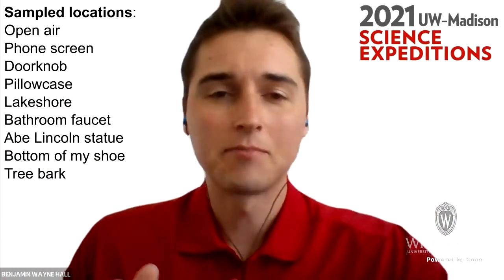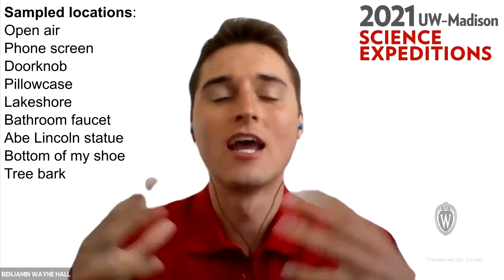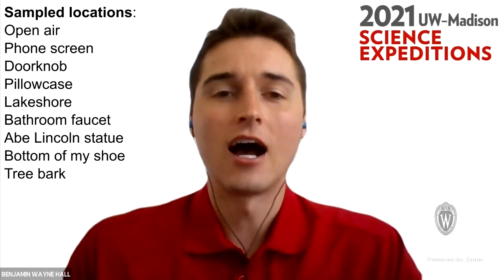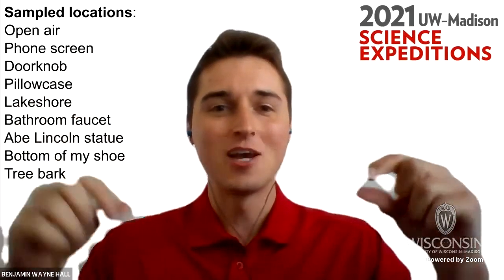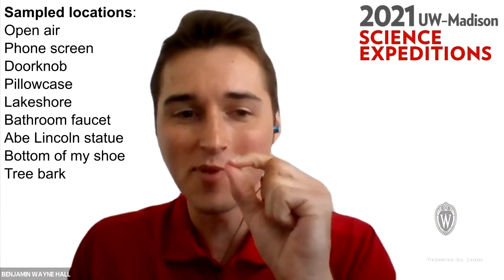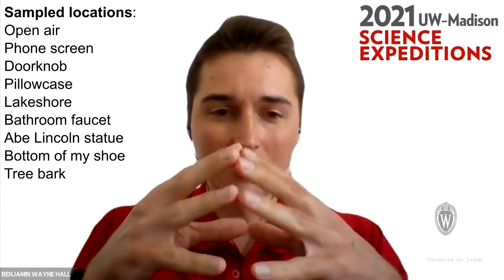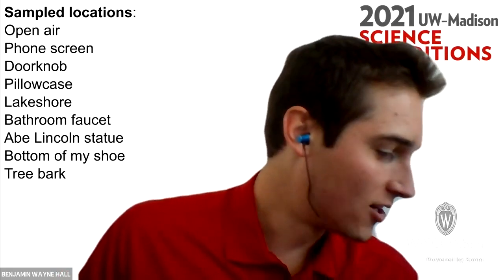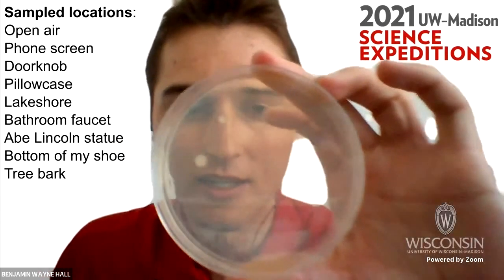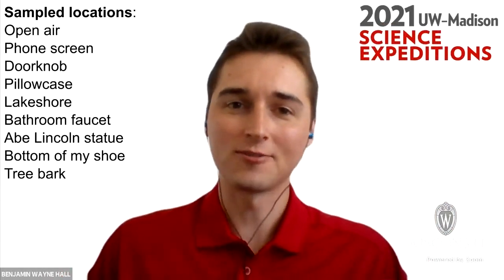They'll sit on that agar in the warm incubator and eat overnight, and they'll grow and divide and divide and divide. Eventually, what starts as one single tiny bacterium that we can't see with our eyes grows and divides until it becomes a big mound, known as a colony. Here, you can see two nice big colonies that grew up overnight in the incubator.